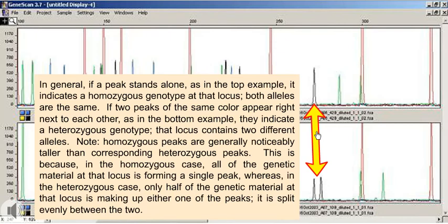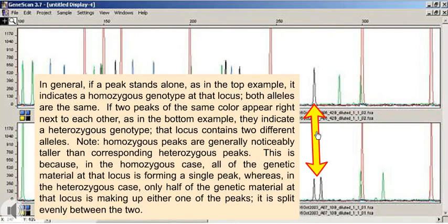In general, if a peak stands alone, as in the top example, it indicates a homozygous genotype at that locus. Both alleles are the same. If two peaks of the same color appear right next to each other, as in the bottom example, they indicate a heterozygous genotype. That locus contains two different alleles.